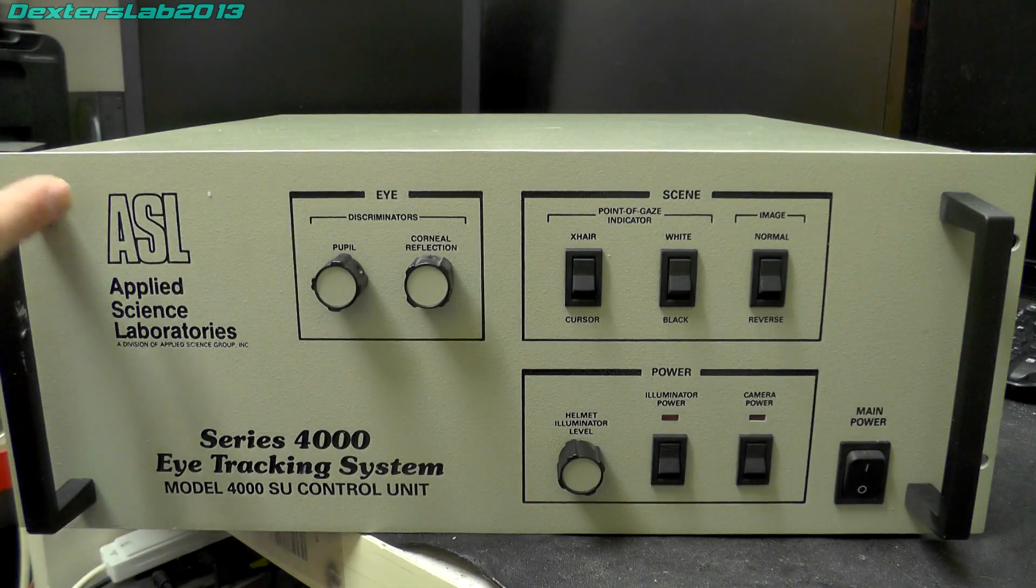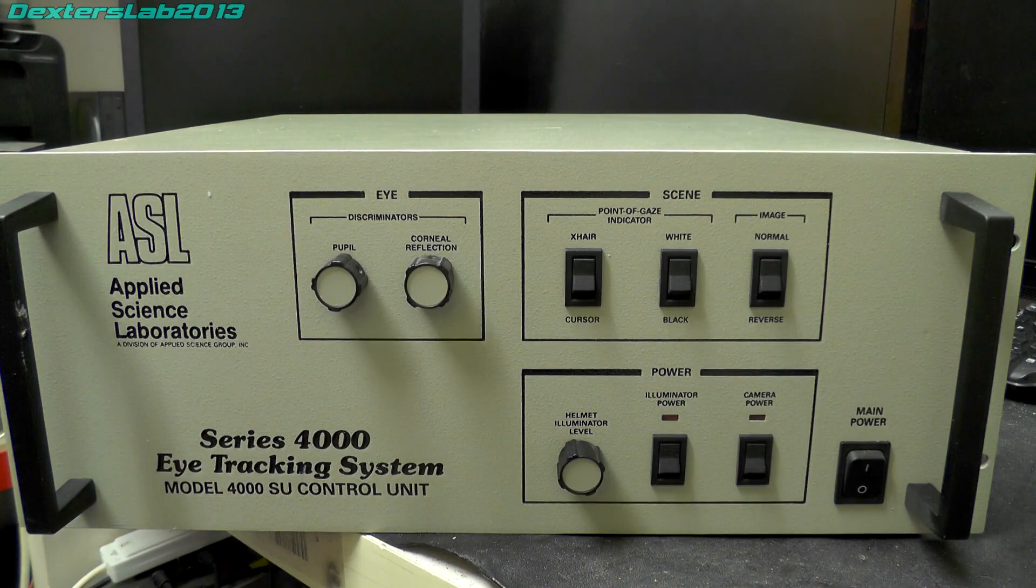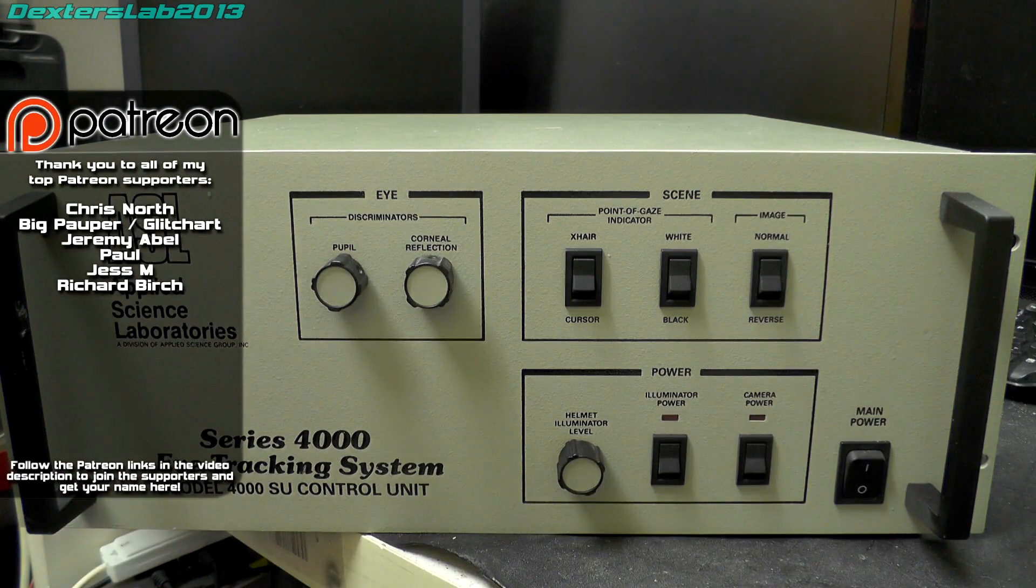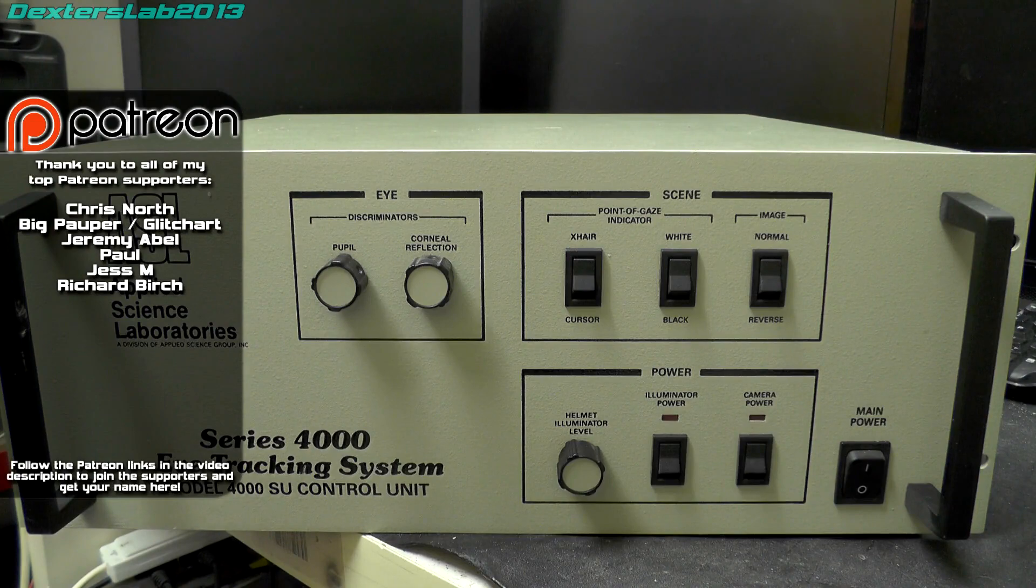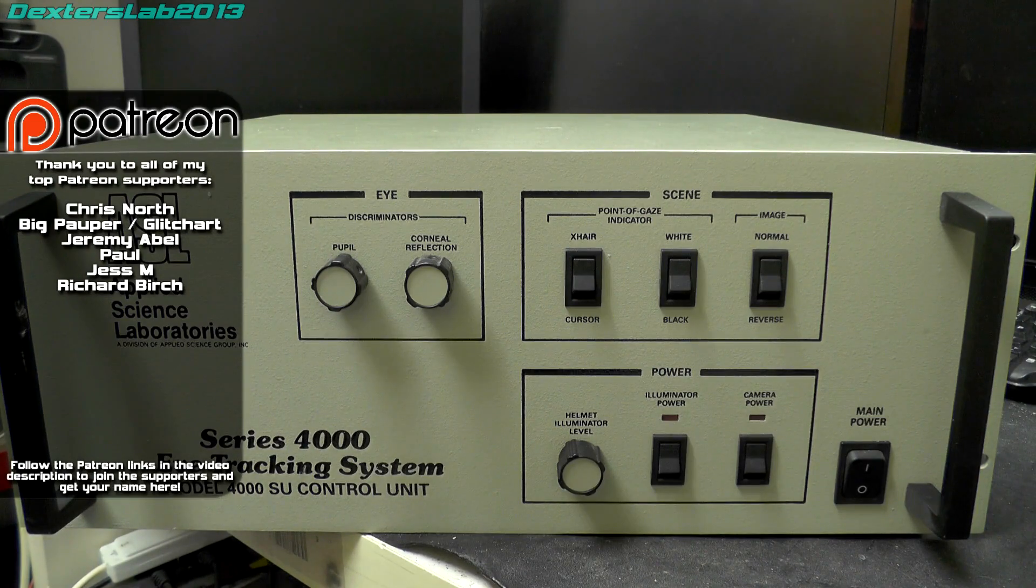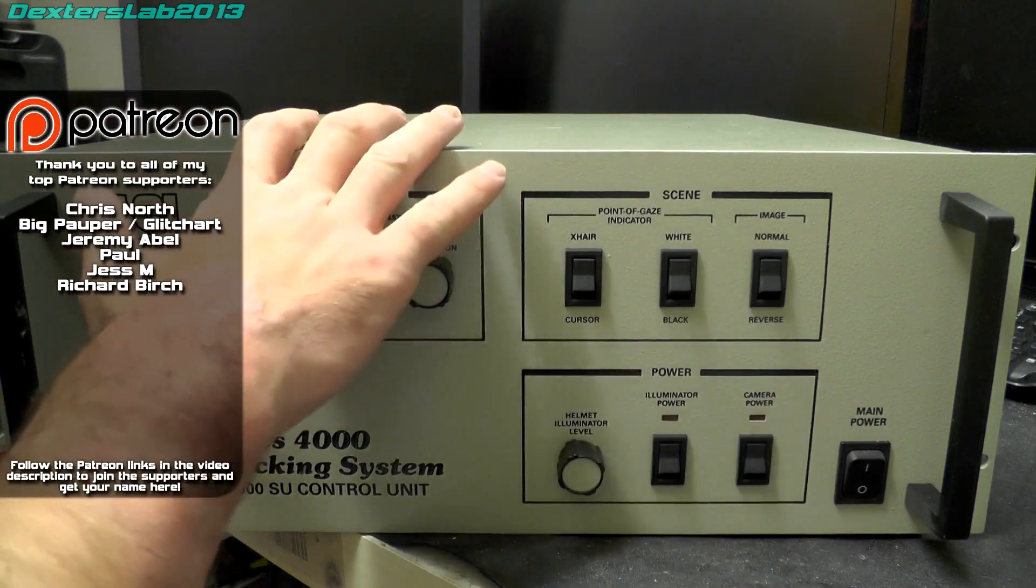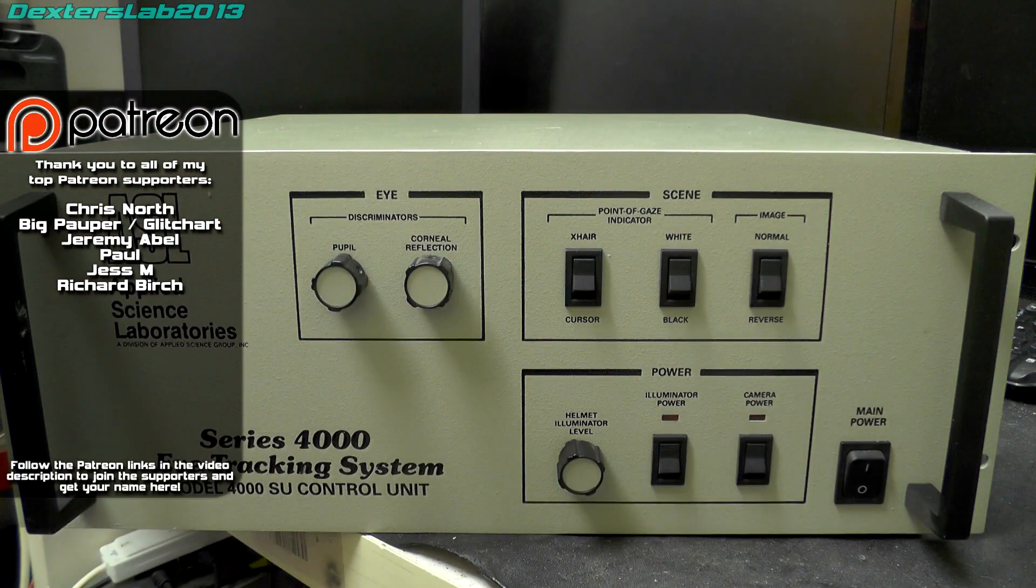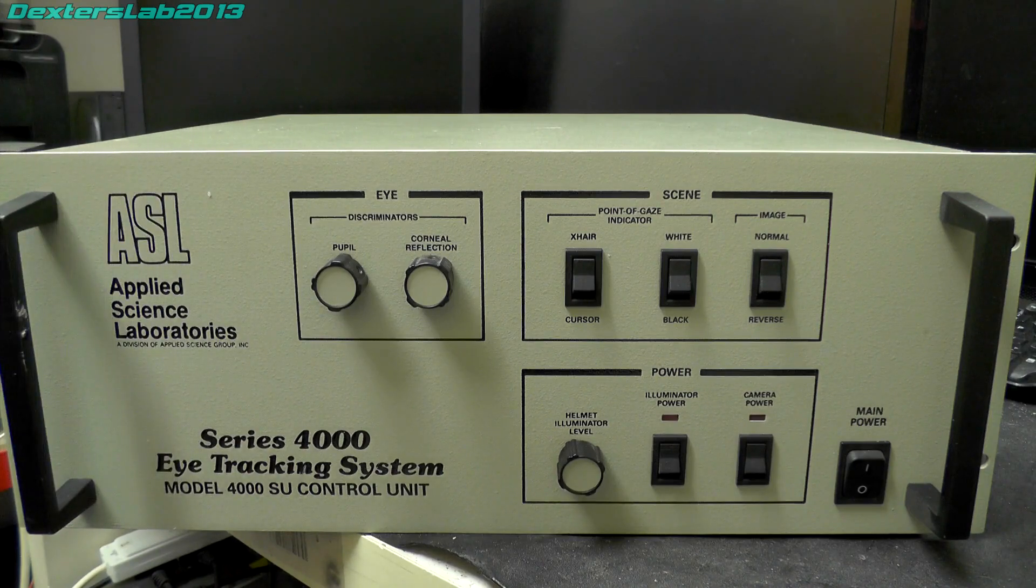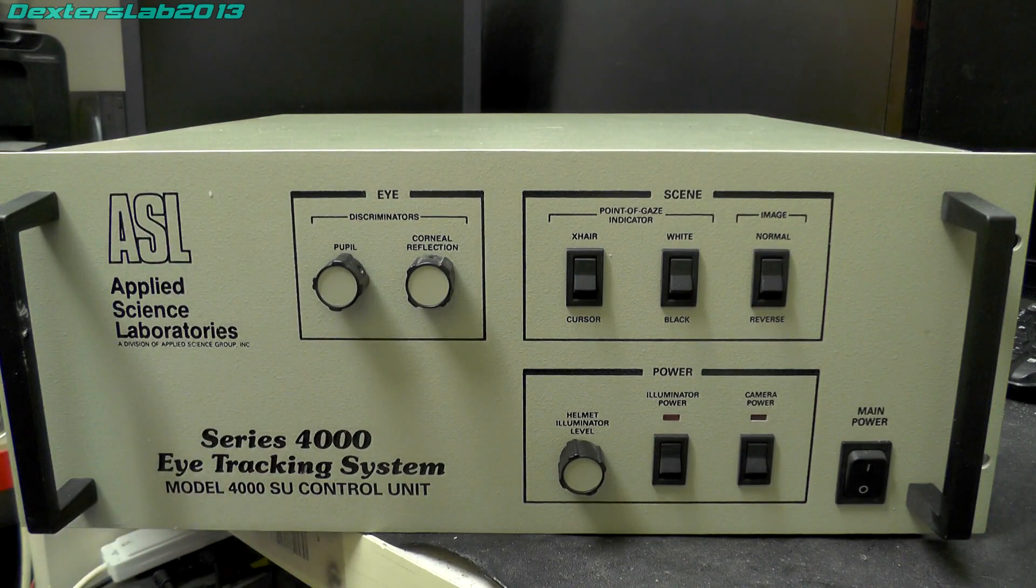I believe ASL, Applied Science Labs, are still going and they're still in the industry of eye tracking. This seems to be an early eye tracking system that was available to researchers, universities and things like that. I have no idea of its original cost and it's not complete. There would have been a bank of monitors with three CRTs that sat on top, connected to a PC. Unfortunately I don't have any of that available, it's literally just this control unit. We've got a few controls on the front, it's all pretty basic stuff.